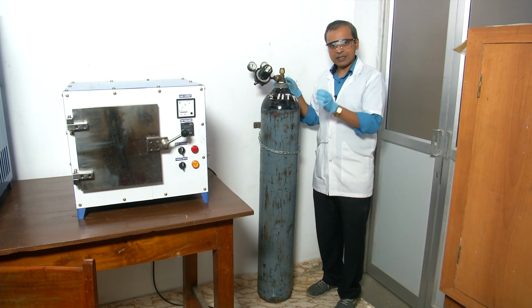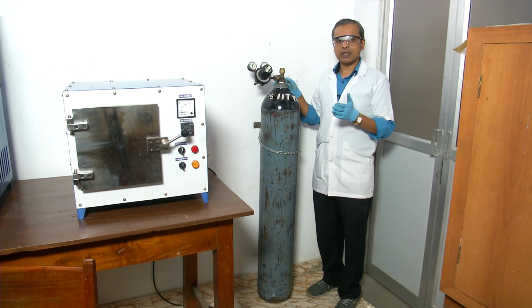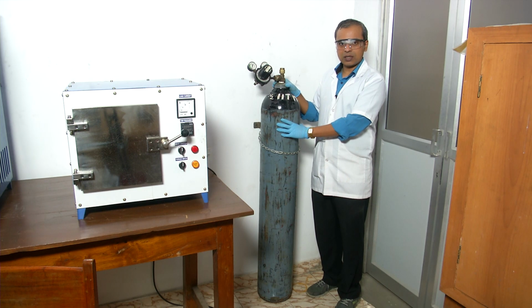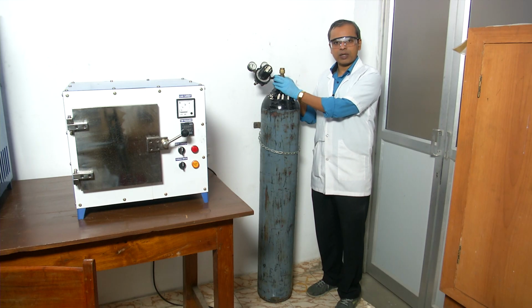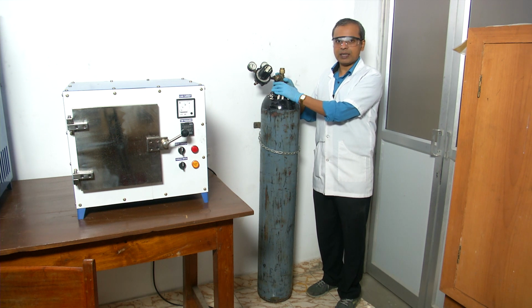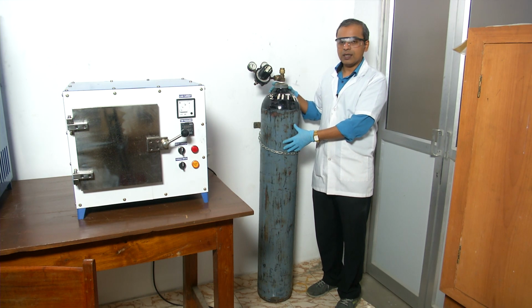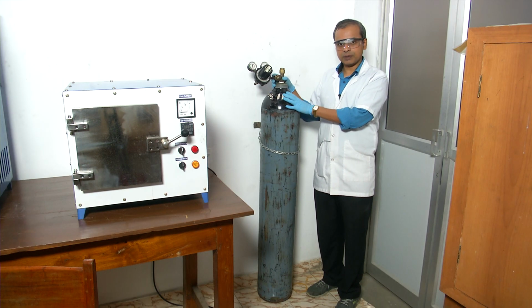A very simple thing that you can do when you are handling gas bottles, but which makes a great difference to safety, is to make sure that you have this kind of a chain arrangement, which holds the gas bottle securely. It does not allow the gas bottle to fall down. This is particularly important the moment you put a regulator on the gas bottle. You must never have a gas bottle in your experimental setup or in your lab where you have put a regulator, where this neck is not covered and you still do not have it restrained or secured.